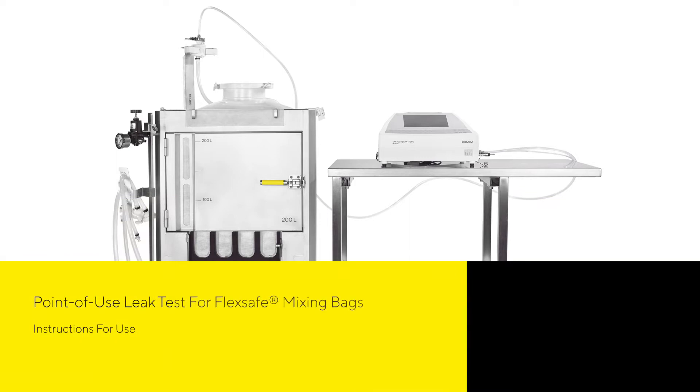This video describes the installation for the point-of-use leak test of FlexSafe mixing bags from 50 litres to 1000 litres.